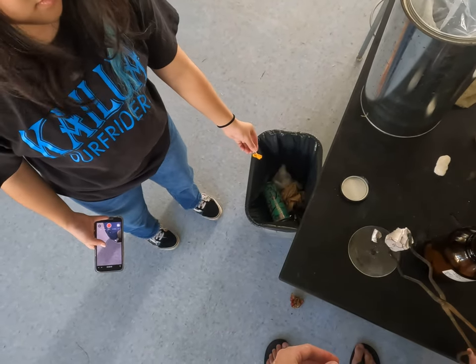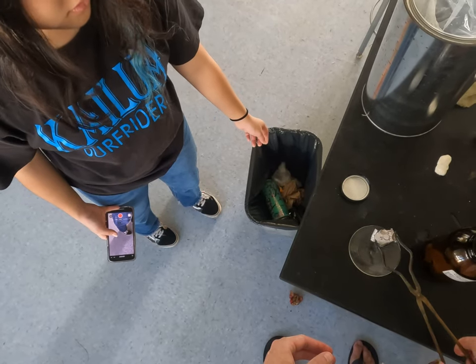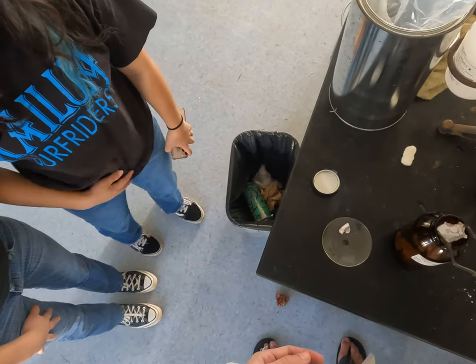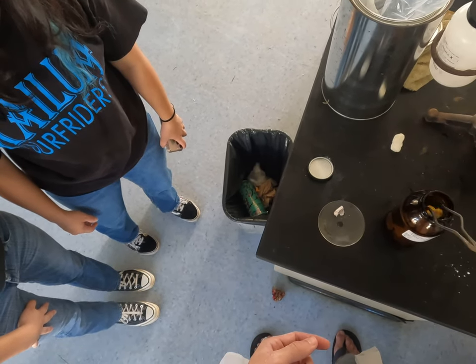It's a metal, it's shiny, and it has a white oxide layer on the outside. It's like bad tofu. Forbidden tofu.